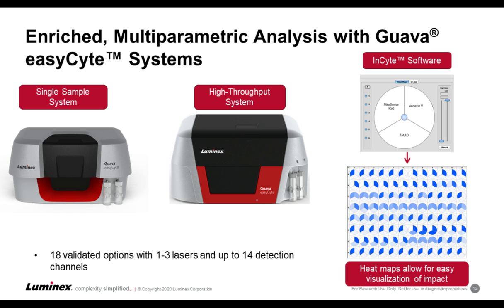I'd like to now move on to another of our microcapillary-based platforms, the Guava EasyCyte systems.